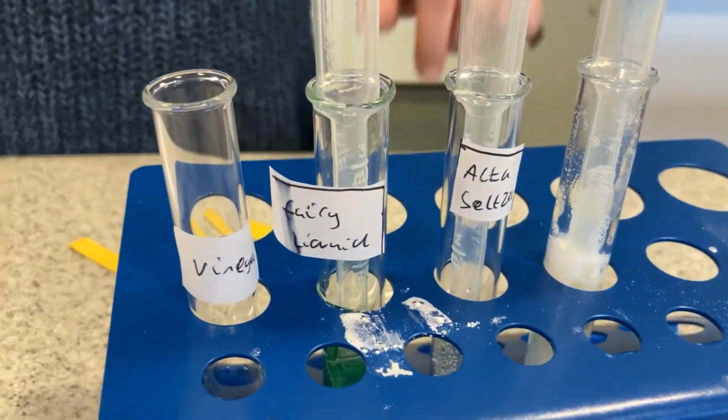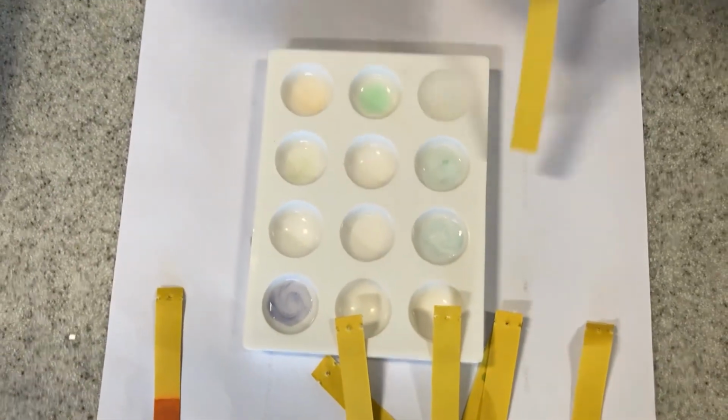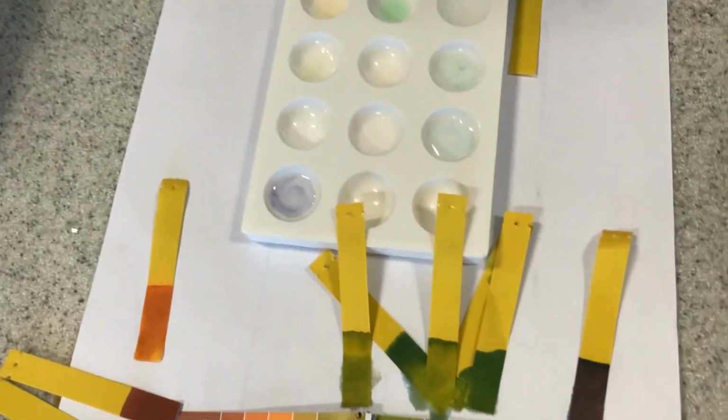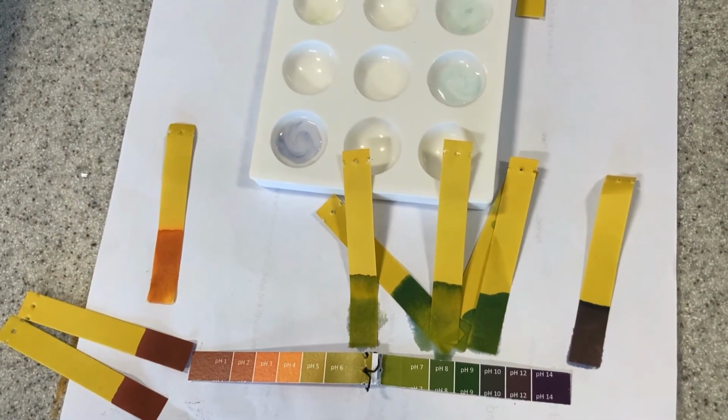So we have acids and alkalis here. They're from what you get in your house. And we've got some really, really strong ones from the laboratory. They change colour if you use something called indicator paper. And obviously, you can have some of these things at home, but some of these things are really quite unpleasant. You can't see me, but I've got goggles on, and I'll be washing my hands in just a minute. Okay?